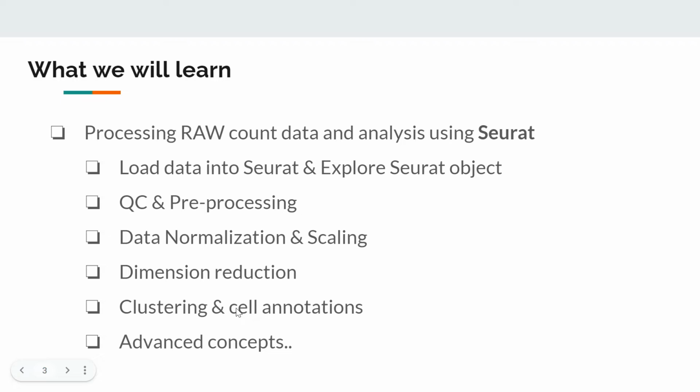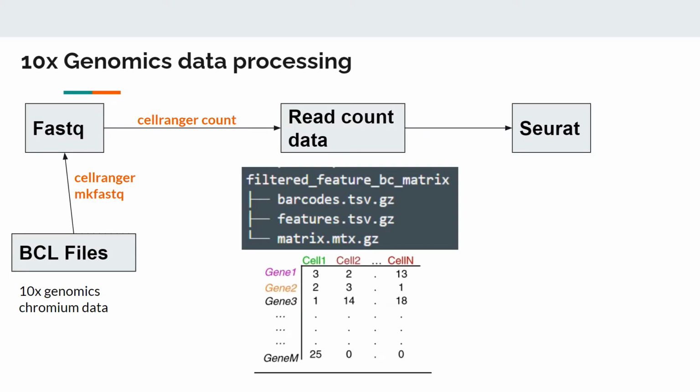Particularly in this video, I am focusing on first loading the data into Seurat, and we will see how Seurat stores the single cell data. So let's start. This is the overview of the pipeline.